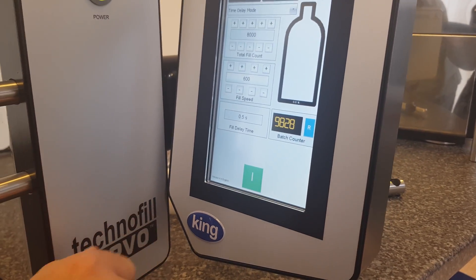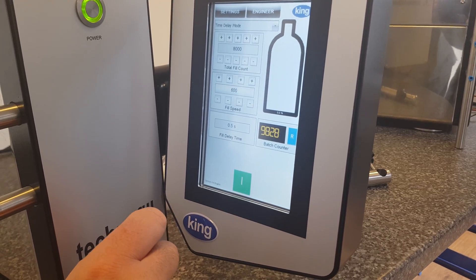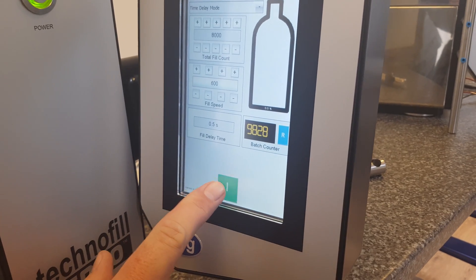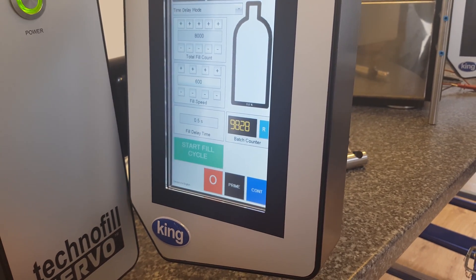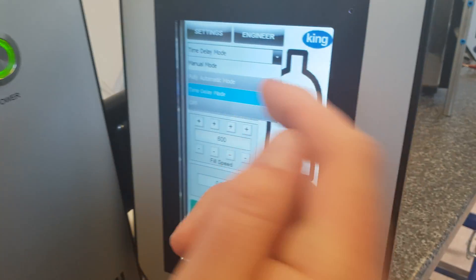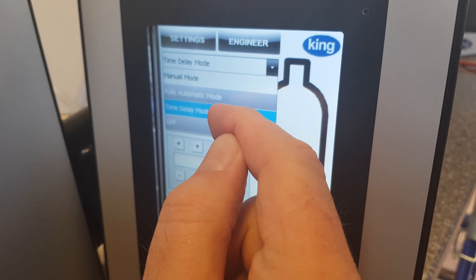When the machine switches on, initially you have this screen displayed. If it's in another language, obviously it'll be in another language, but we'll run through it in English. So the first thing you're going to do is switch the machine on. At the moment we have it in time delay mode. Modes are manual mode, fully automatic mode, and time delay mode.